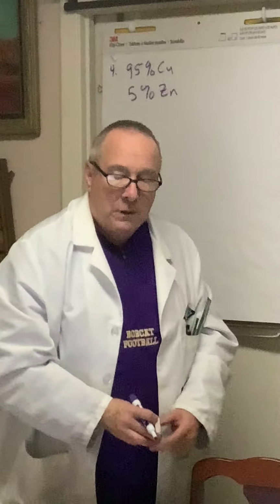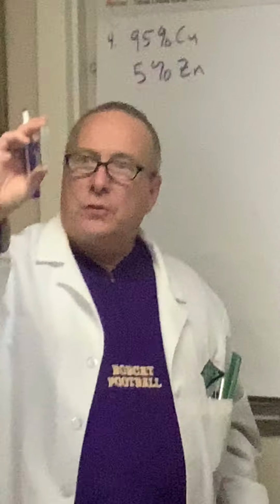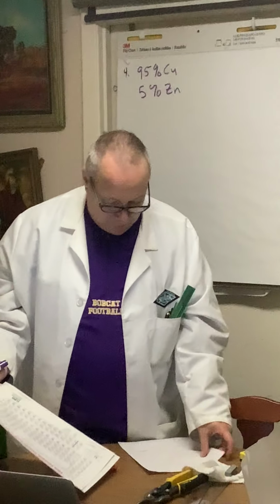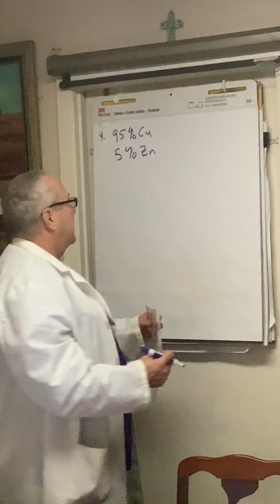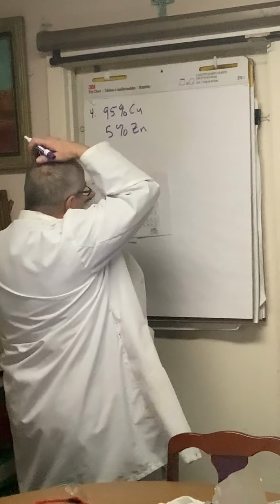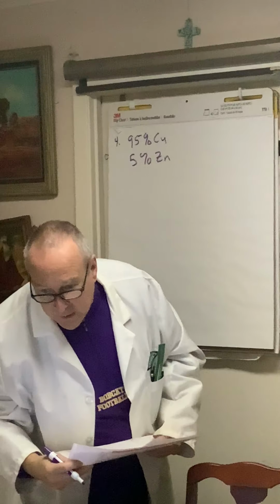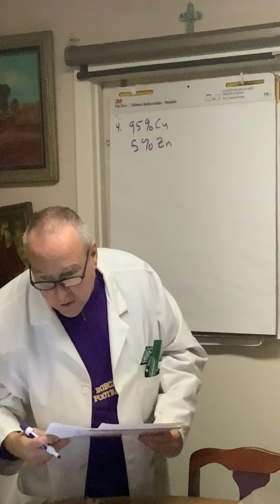Here is a mole, a quantity of copper, pure copper. Here's a mole of pure zinc. It's less dense than copper. But you can see they have very similar molecular weights, atomic masses, but quite different volumes. But 2 very common metals used a lot in industry, used in minting. And copper, I always learned it was 97 and 3%, but it says in a pre-1982 penny, calculate the mass of copper and the mass of zinc.